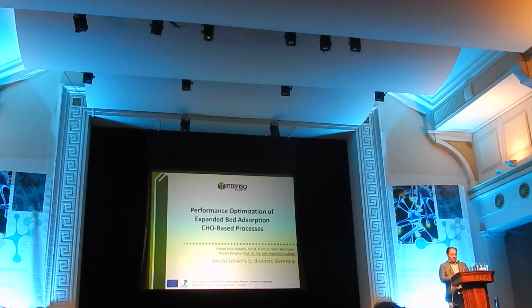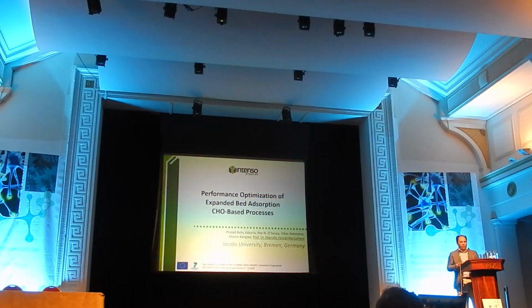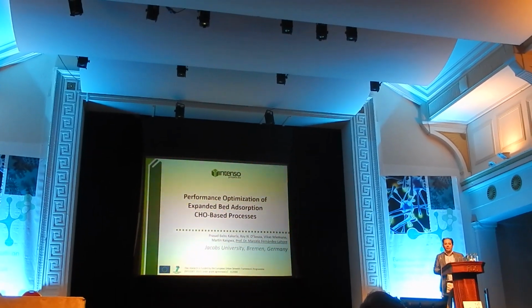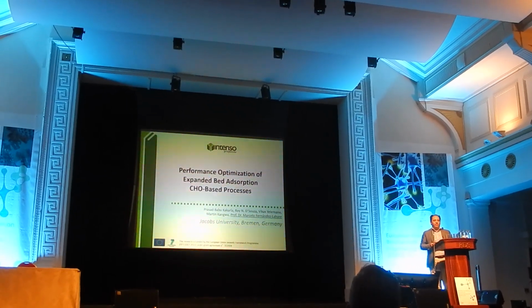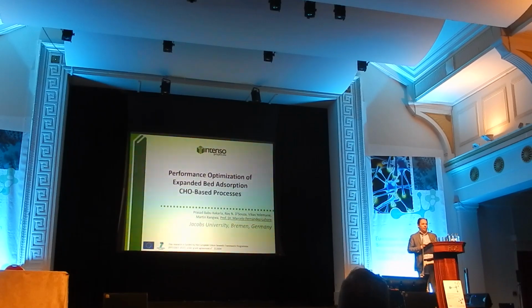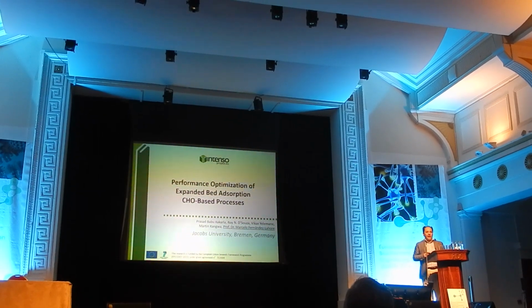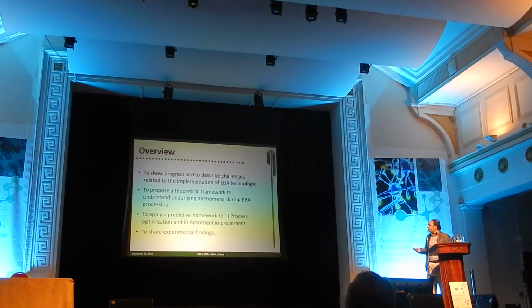So I would like to introduce and expand on the topic of expanded bed adsorption, and especially show some progress that we have been making in the last years, focusing on the applications of expanded bed adsorption as a technique to purify antibodies or recombinant proteins coming from mammalian cell cultures.